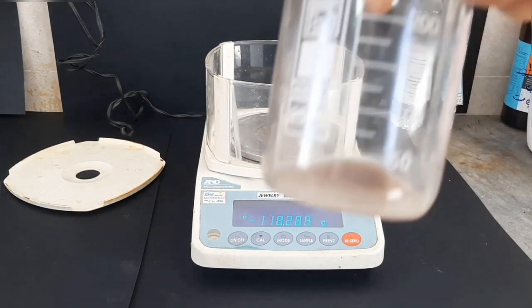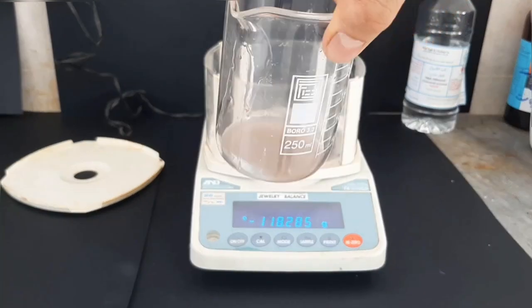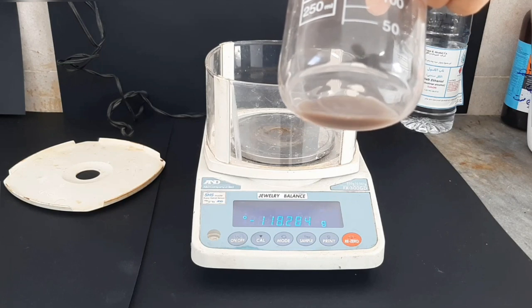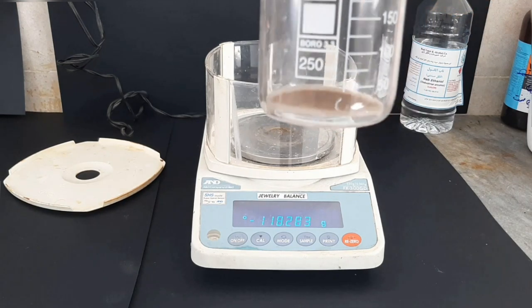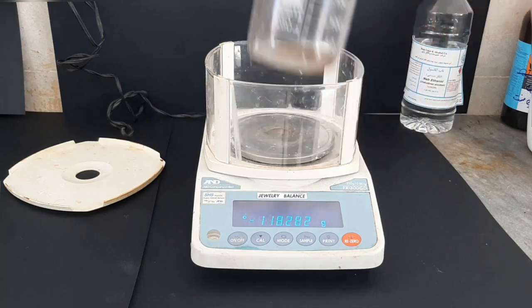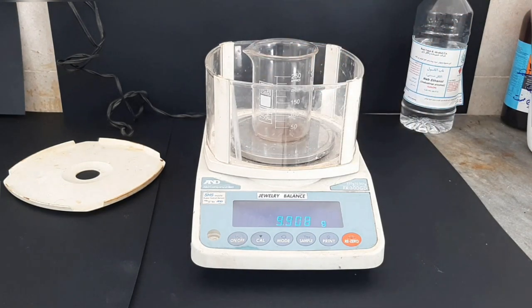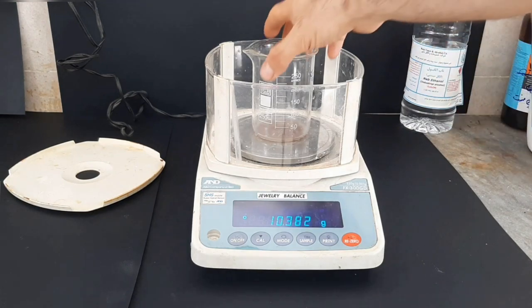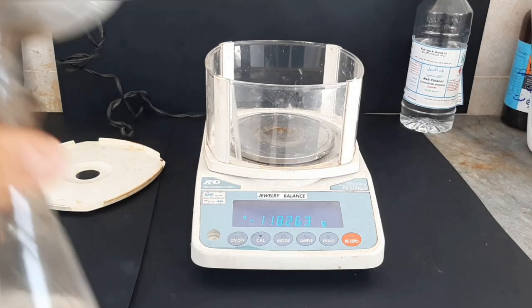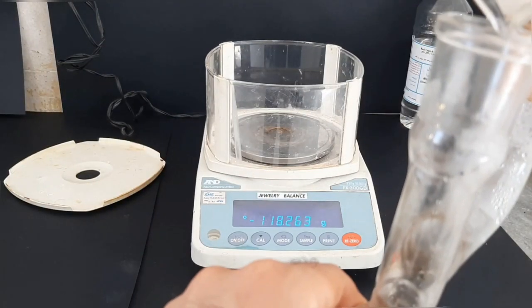Sulfuric acid here is used as a catalyst and we need around 10% of the amount of acetic acid, but my sulfuric acid is not very pure. As you can see, it has a little bit of a brown color, so I use another 4 grams of it, 10 grams in total of sulfuric acid as a catalyst.